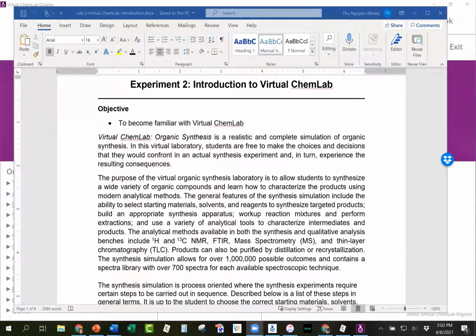So I started using Beyond Labz in my class last summer when everybody was online, and I thought it was a really fantastic program. So even though we are back to face-to-face instruction in the fall, we still use Beyond Labz as a filler in between. We split up our labs so that half of the students are in there to have the social distancing. They're doing wet labs every other week, and then we fill in the off weeks with Beyond Labz.